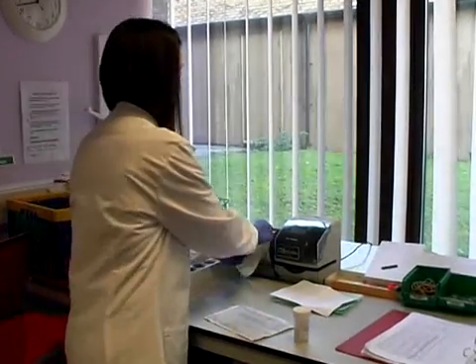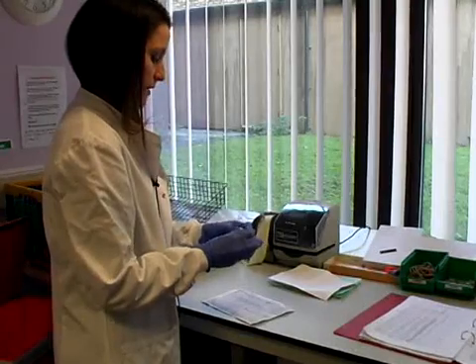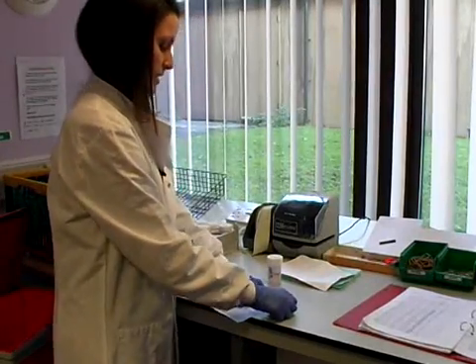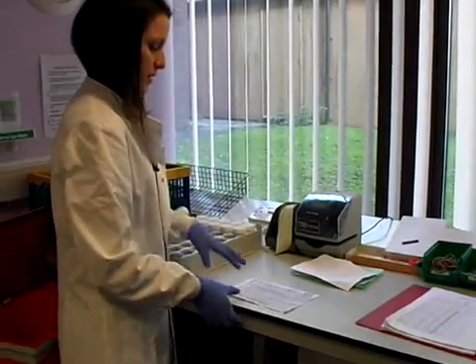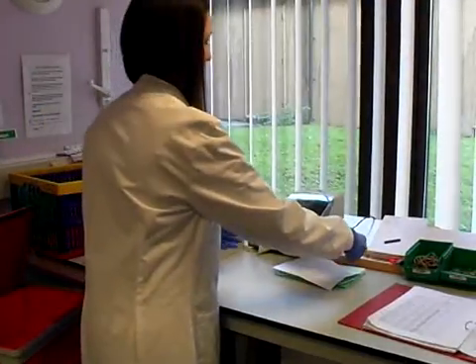We then give the pot a unique barcode and we also give the form the same barcode so we can match up the slide, once it's processed, with the form. We then loosen the lid of the vial, put it in our rack which will go into our big processing machine, and then we date stamp the form.